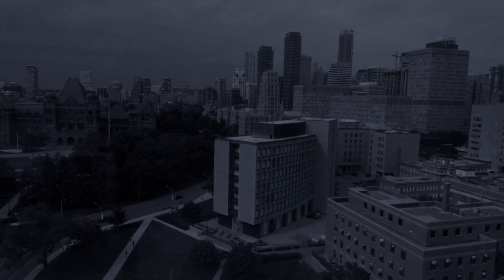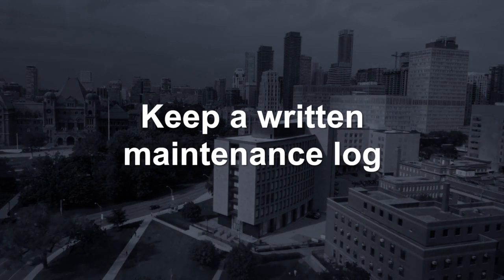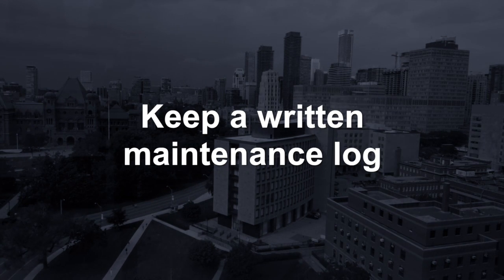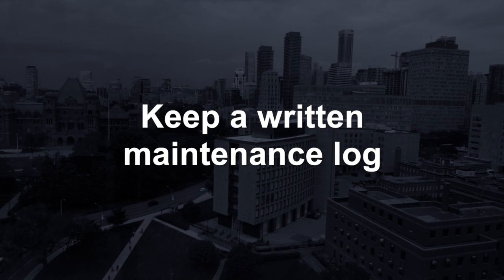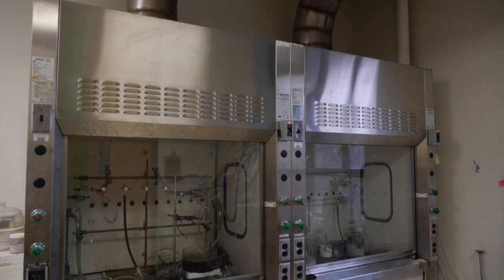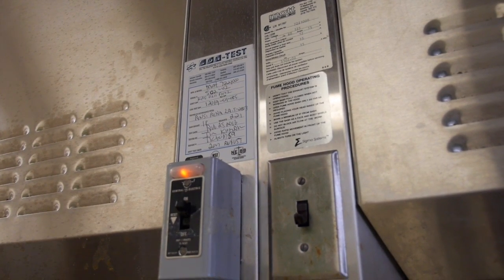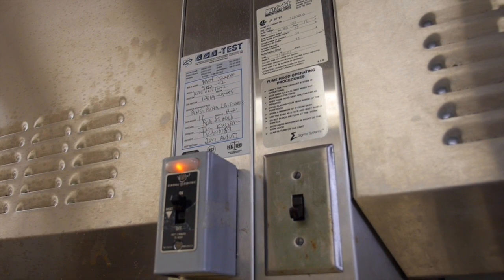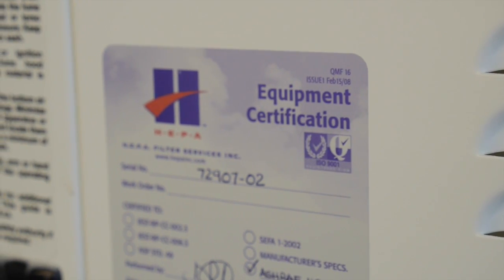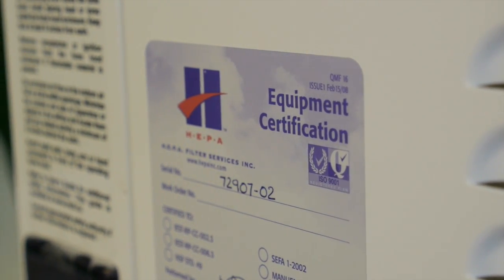In order to prolong the life of fume hoods and ensure safety, a written schedule of preventative activities conforming to the manufacturer's instructions should be developed. All maintenance activities need to be documented in a maintenance log that's readily available. Fume hoods should be certified annually to ensure that they're operating functionally. You will note a calibration sticker on the fume hood showing the company that inspected it, the date of inspection, and the next inspection date.